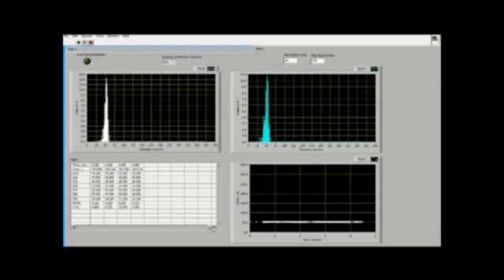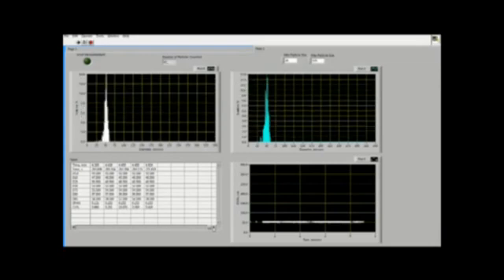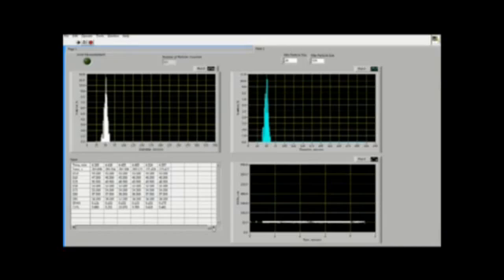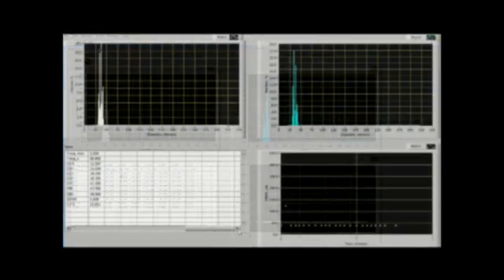This is operating at 20 hertz, giving us 52 micron oil droplet sizes, around about 9 to 10 percent CV.